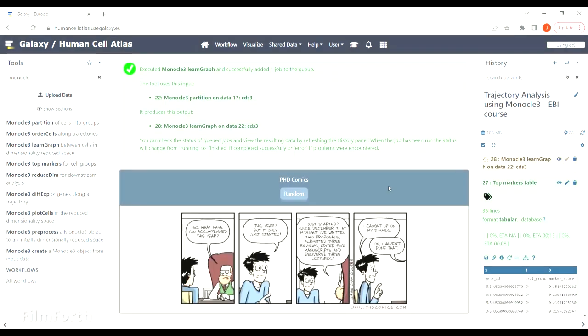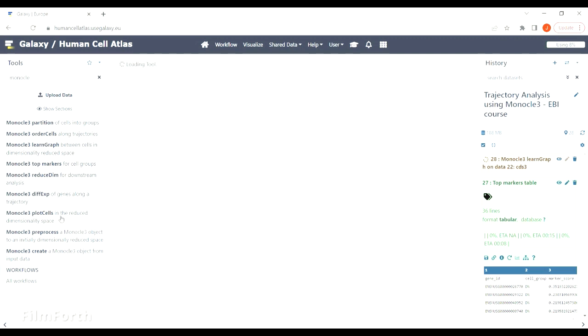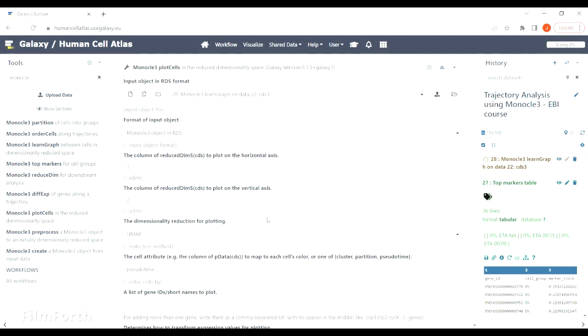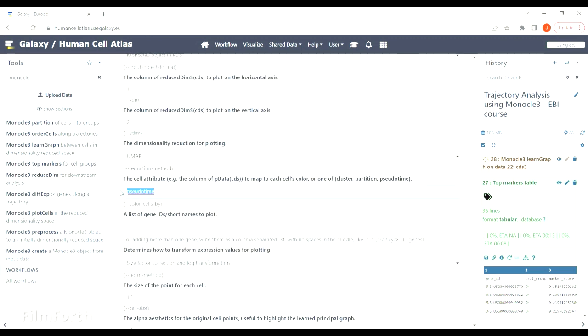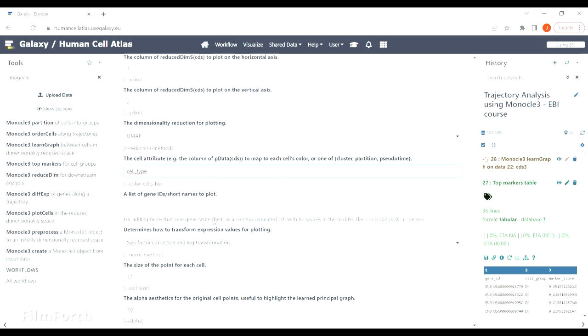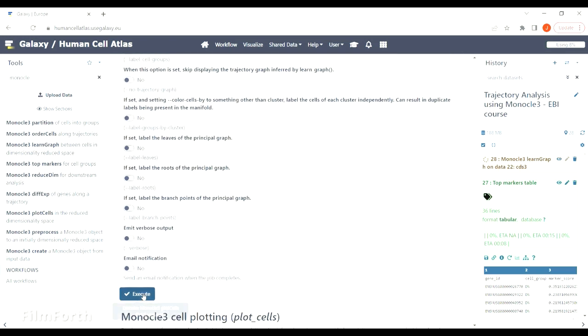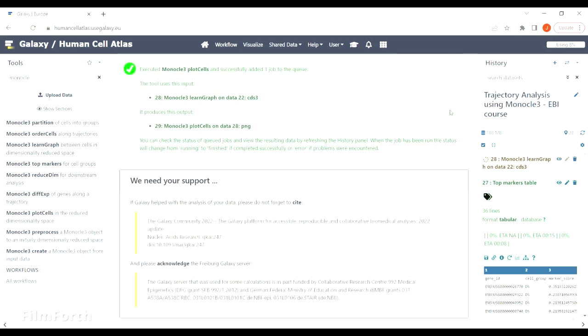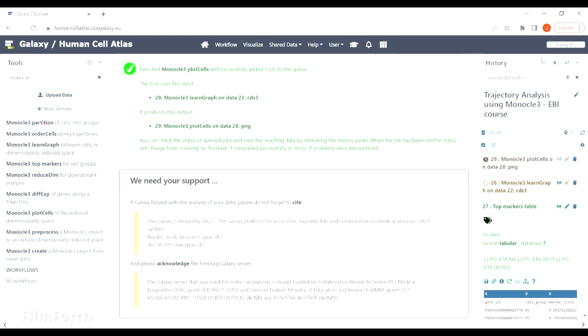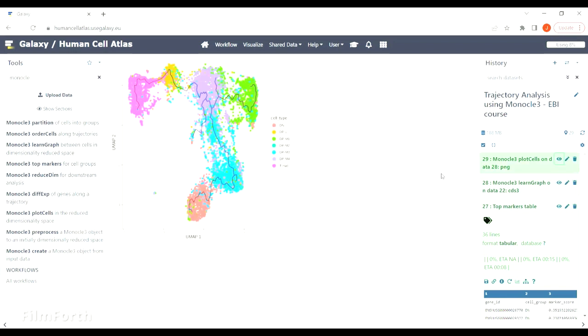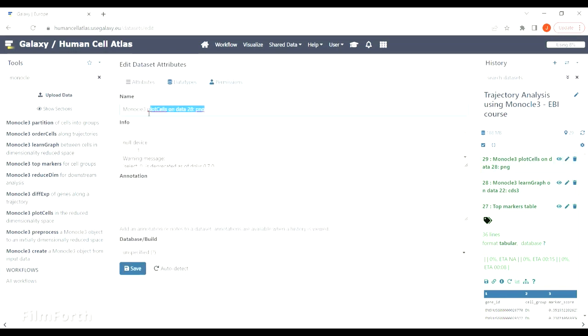In the meantime, you can use another tool to plot the learned trajectory graph onto the cell types. As you can see, the trajectory graph is just a line going through the whole dataset.